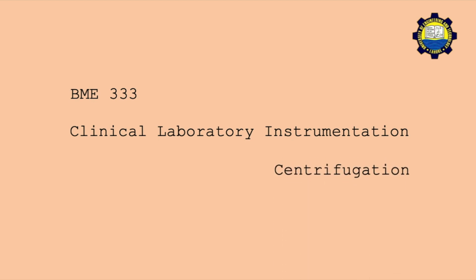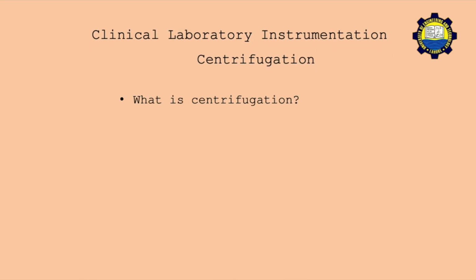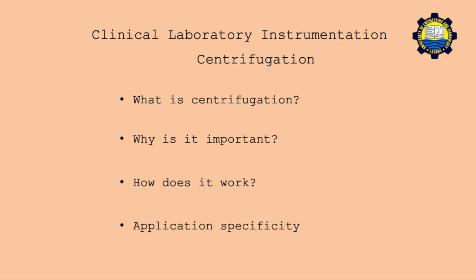What we're interested in today is centrifugation. We're going to structure our talk with a brief understanding of what is centrifugation. We'll try to link it up with the process of sedimentation and see how centrifugation is inspired from sedimentation. Next up, we will see why centrifugation is so important. What are some of the applications in historical perspective and even in modern times that make centrifugation so important to study? We will then see how centrifugation works. We'll understand the forces at play as well as the behavior of the particles throughout this process. And finally, we will conclude our discussion with some applications of different types of centrifuges.